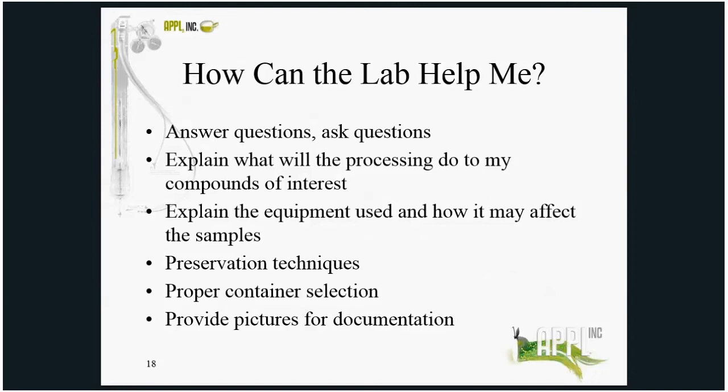They will have the knowledge to ask you questions and be able to explain the entire process to you, including if and how your samples will be affected. They'll tell you if your samples need preservation and what type, and they can guide you in the proper selection of containers, and can demonstrate how your samples are processed entirely through the process. And we actually do this through the use of photographs.